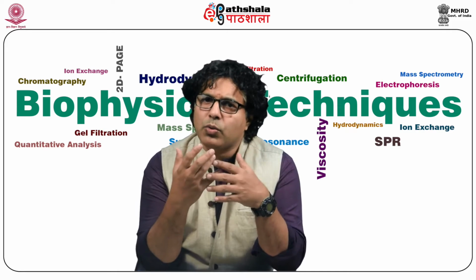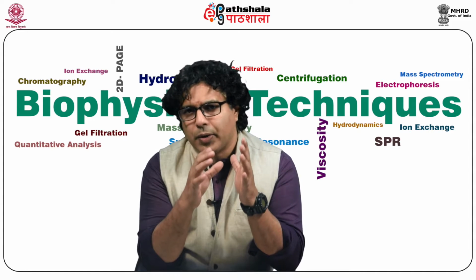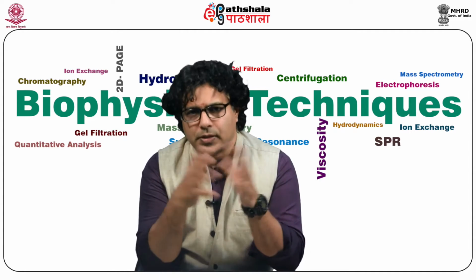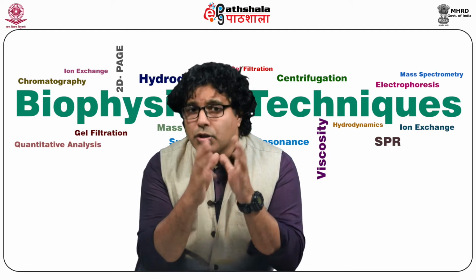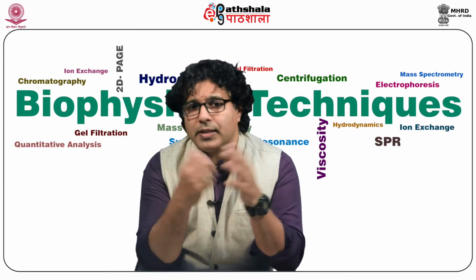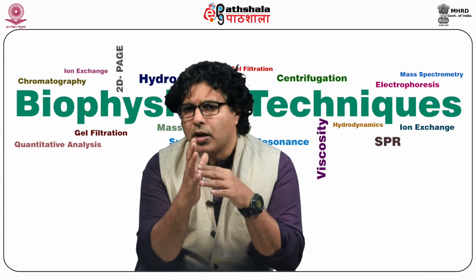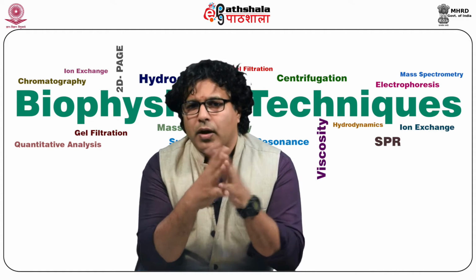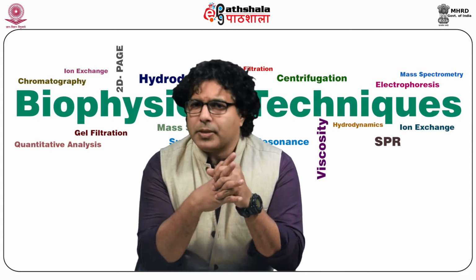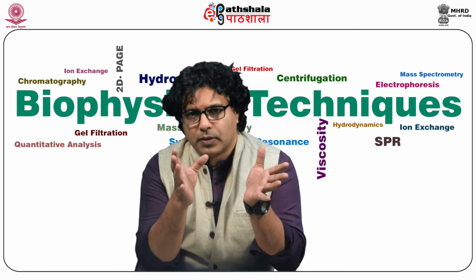Whenever we do subspecies analysis, where there is a commonality, the fragmentation pattern helps us to see similar species. Similarly, neutral loss or gain can be seen in the scanning mode, where fragmentation leads to the loss or gain of a neutral. This gives complete qualitative information about the molecular structure.